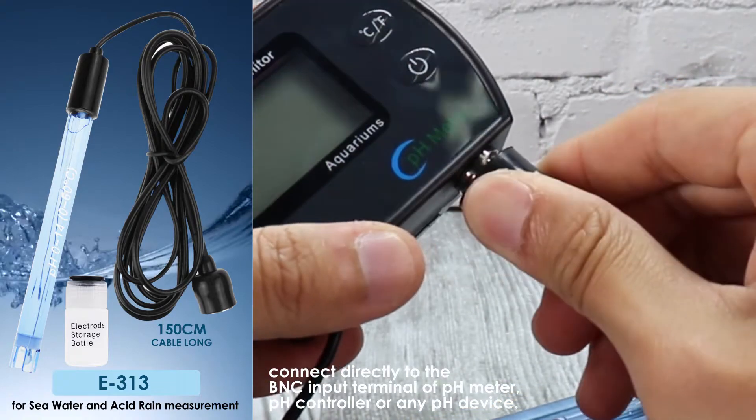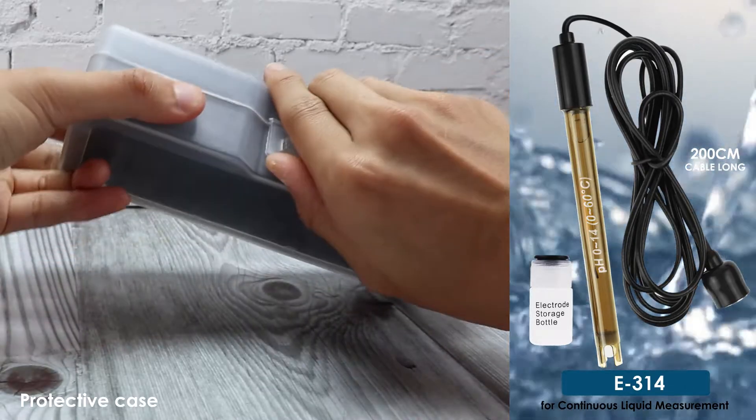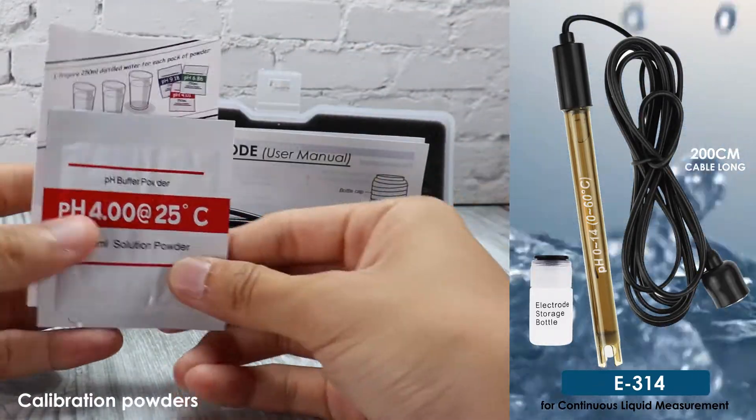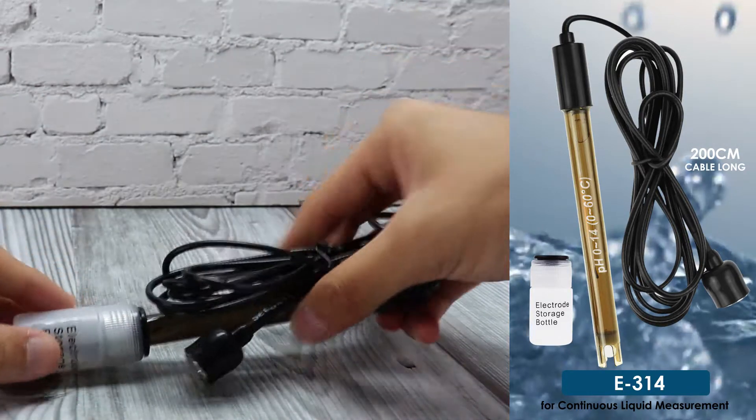E314 comes with a 200 centimeter cable and can measure liquid continuously. It includes three pH powders and its own storage bottle.